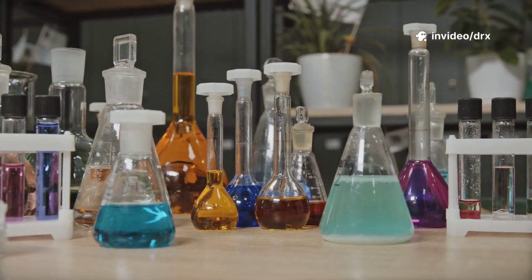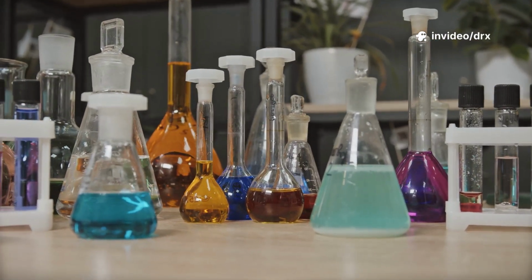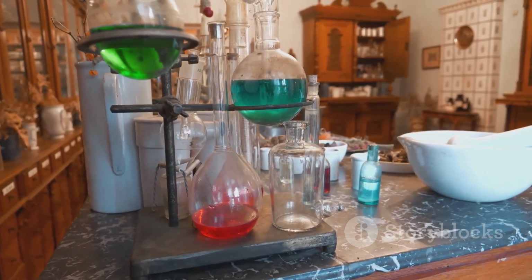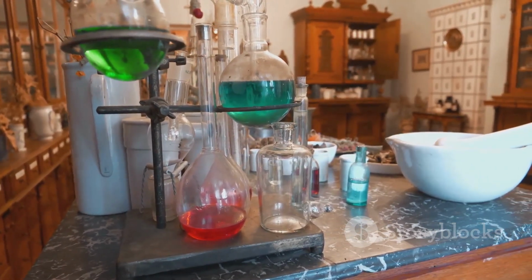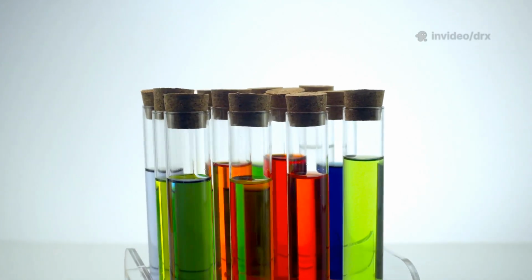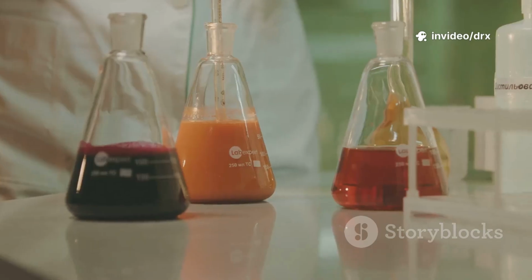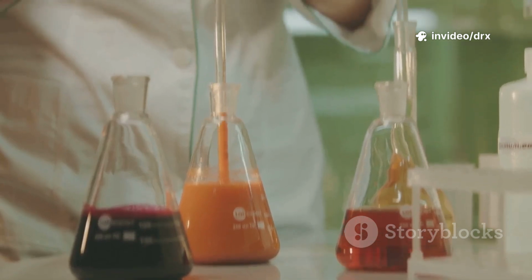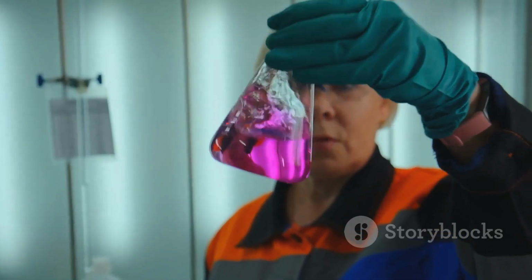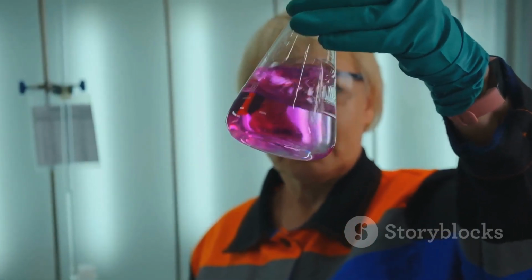But not all acid-base titrations are the same. There are four main types. First up, strong acid versus strong base. This one gives a sharp endpoint. Indicators like phenolphthalein or methyl orange work great here. Next, strong acid versus weak base. Usually I prefer methyl orange. For weak acid versus strong base, phenolphthalein is the way to go.